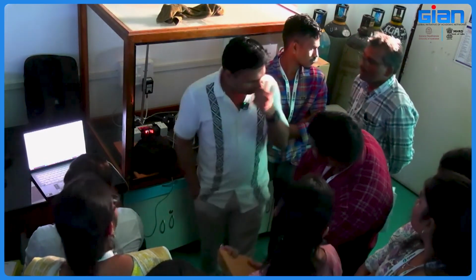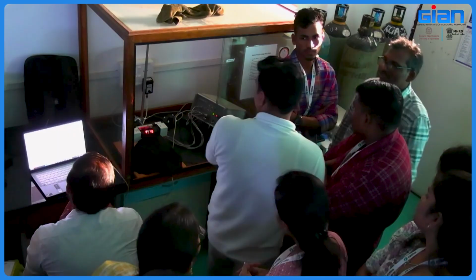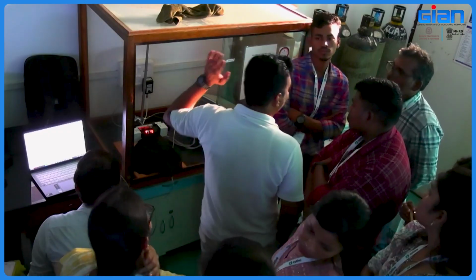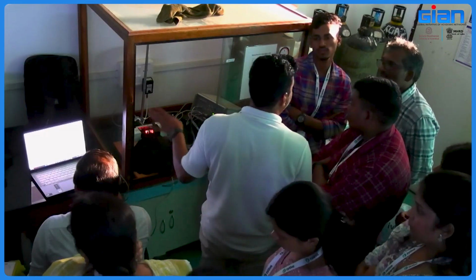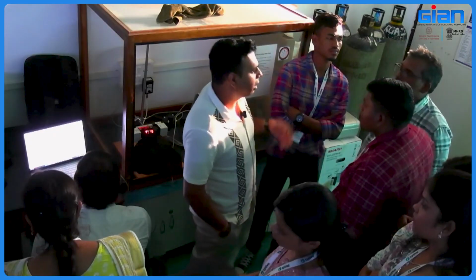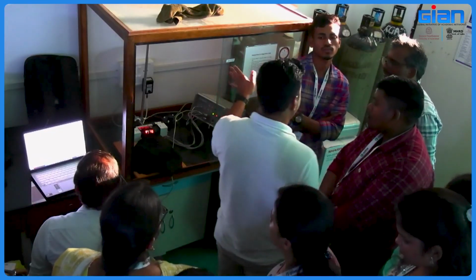So here we are keeping one sample only, but yesterday with the HandyPEA there was only one test, but here many. Yeah, this you can keep one leaf at a time, but this one is more precise. It's far costlier than that one also. So with this you can measure a lot of parameters. Light curve is just maybe 5-10% part of PAM. You can measure everything, cyclic electron transport and everything in it. You have to make a script file for that. But by default, the light curve is the first way to go.